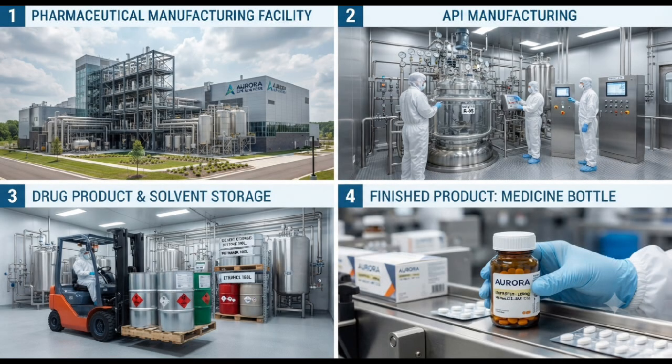Residual solvents are volatile organic chemicals that are used or produced during the manufacturing of pharmaceutical substances, excipients, or drug products. Although these solvents are generally removed during the manufacturing and drying process, a small quantity may remain in the final pharmaceutical product because some solvents can be toxic. Controlling and testing residual solvent is an important part of pharmaceutical quality control and patient safety.